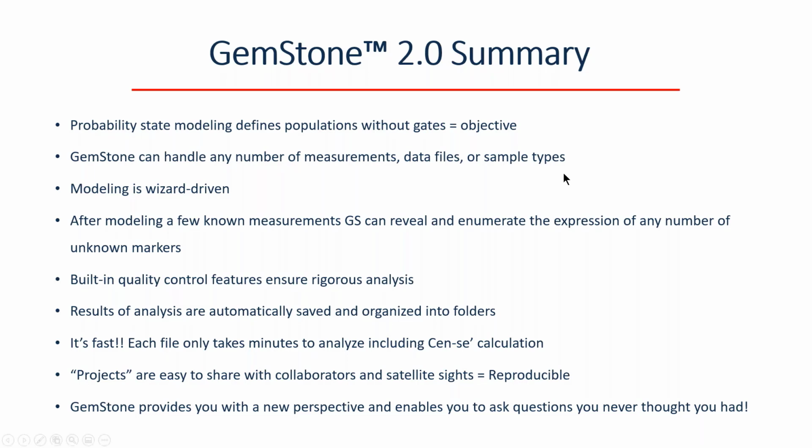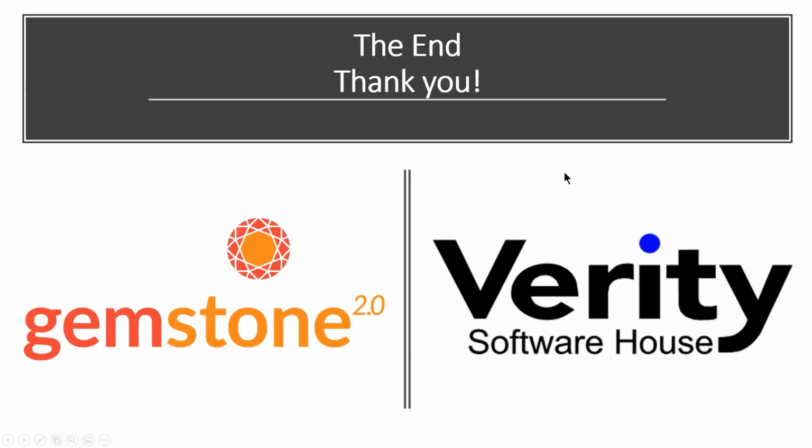Thank you, Beth, for your presentation. I think we've got time for a couple questions before we transition to our last speaker. One is, what if you don't know the biology of all the different markers in the panel you're looking at, and you're trying to look for some novel subsets? What would you recommend for those types of users, those types of applications?